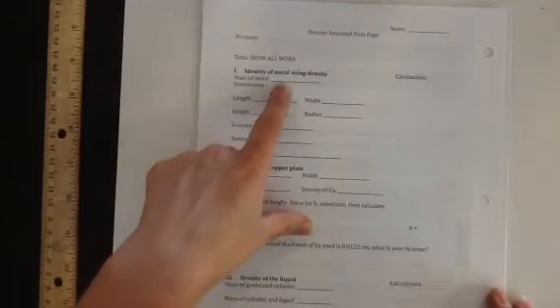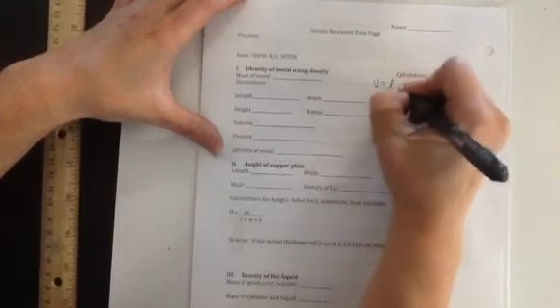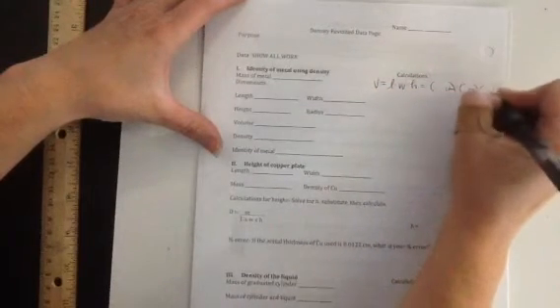And if we look at your answer sheet area, the first thing you're going to calculate is the mass of your metal. And what measuring device will you use to do that? The electronic balances. Fantastic. So you're going to record all of the data from your electronic balance, and then you're going to calculate length, width, and height. And some of you have a cylinder, and so your equation may require you to calculate radius, to calculate volume. So over here on the side, I should see V equals L, W, H equals something, something, something.